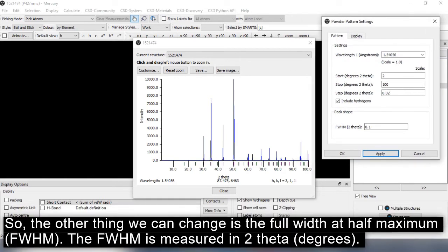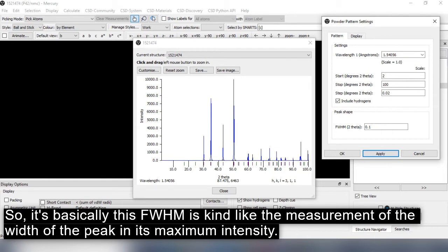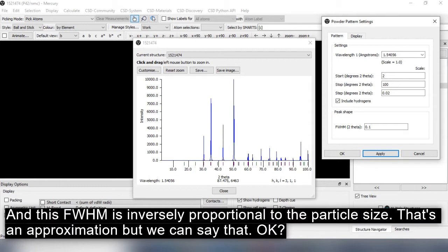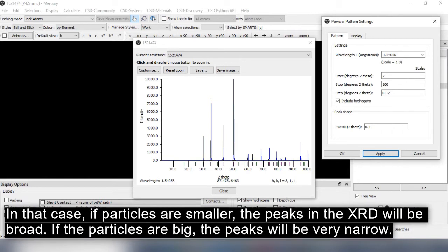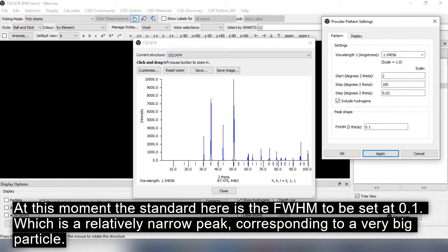The other thing we can change is the Full Width at Half Maximum, or FWHM, measured in two-theta. The FWHM is the measurement of the width of the peak at half of its maximum intensity. This FWHM is inversely proportional to the particle size — if the particles are smaller, the peaks in XRD will be broad; if the particles are big, the peaks will be very narrow. The standard FWHM is set at 0.1, which corresponds to a relatively narrow peak for a very big particle.